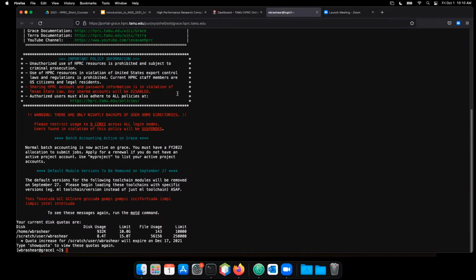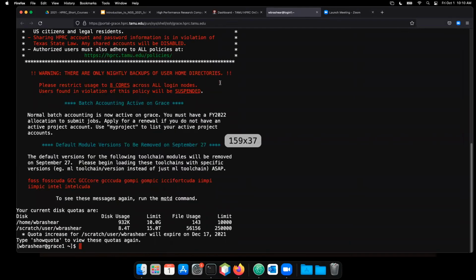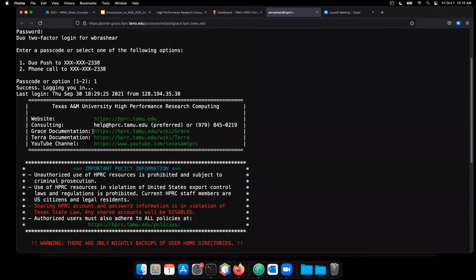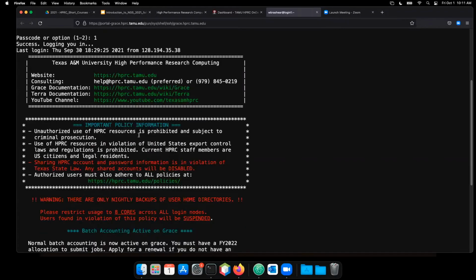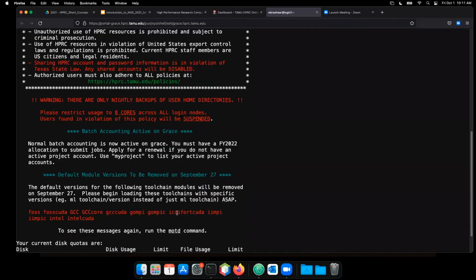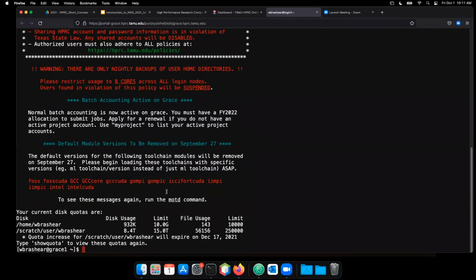All right, so this is what pops up when you first log into Grace. After you log in, you see this message printed out. It has information on how to contact HPRC, the website, some documentation, the YouTube channel, and policy information regarding Grace usage. This here is the message of the day, and that can change and give you important announcements about something like cluster maintenance, so make sure to check that.